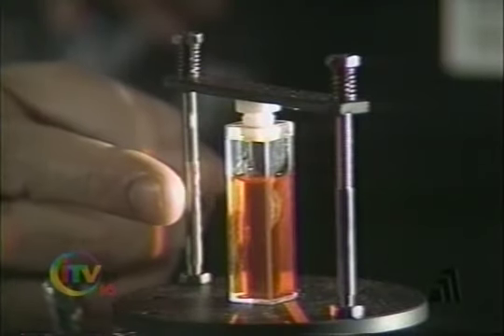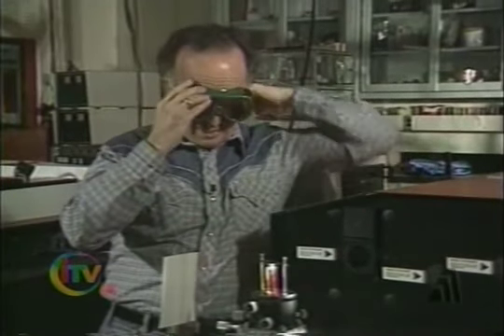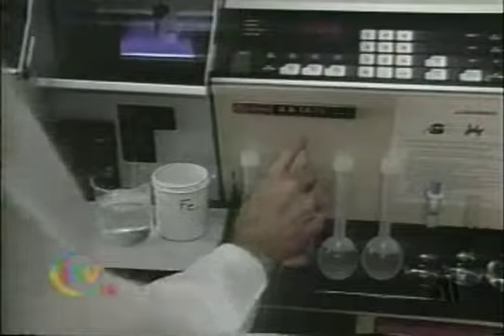Here is a molecule in solution. Let's turn off the lights and turn on the laser beam. What you see is light of a certain color coming out from the laser into the sample, and then coming out after passing through the sample, a different color. These imprints of a molecule on electromagnetic radiation, interpreted by us, are the signals from within which tell us what it is that we have.